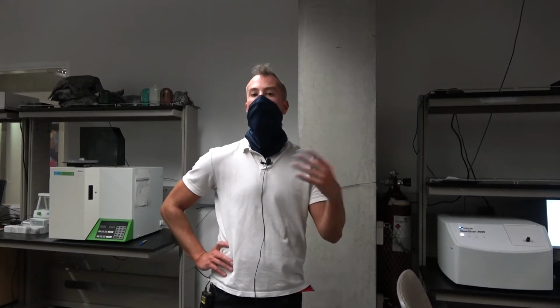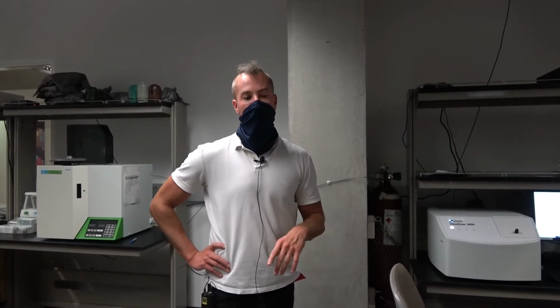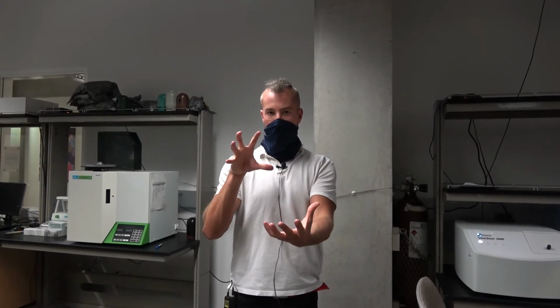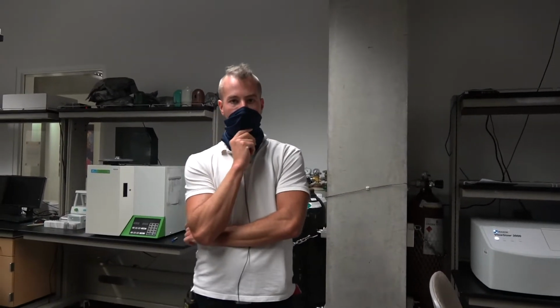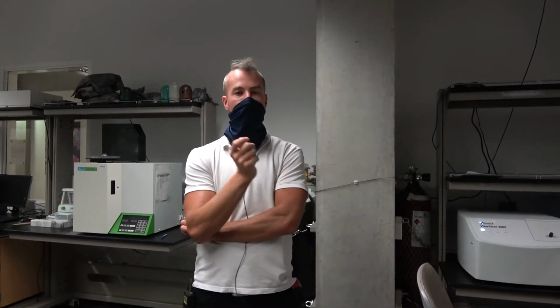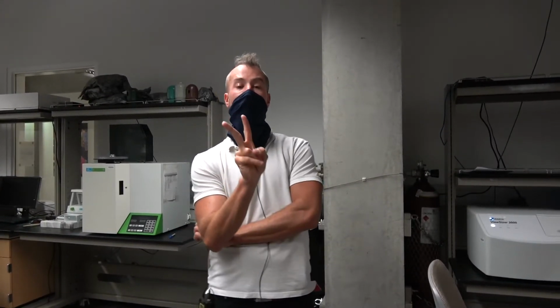tool to have. Now, if you'll recall when I talked about concentration, we talked about another way to determine the number of particles per ml, right? We talked about using the concentration in milligrams per ml, the volume of one particle, and the density of the material to back calculate how many particles per ml we have. So this is going to be an exercise to kind of compare how similar are these two samples, or excuse me, these two ways of determining that value of nanoparticles per ml. Okay?